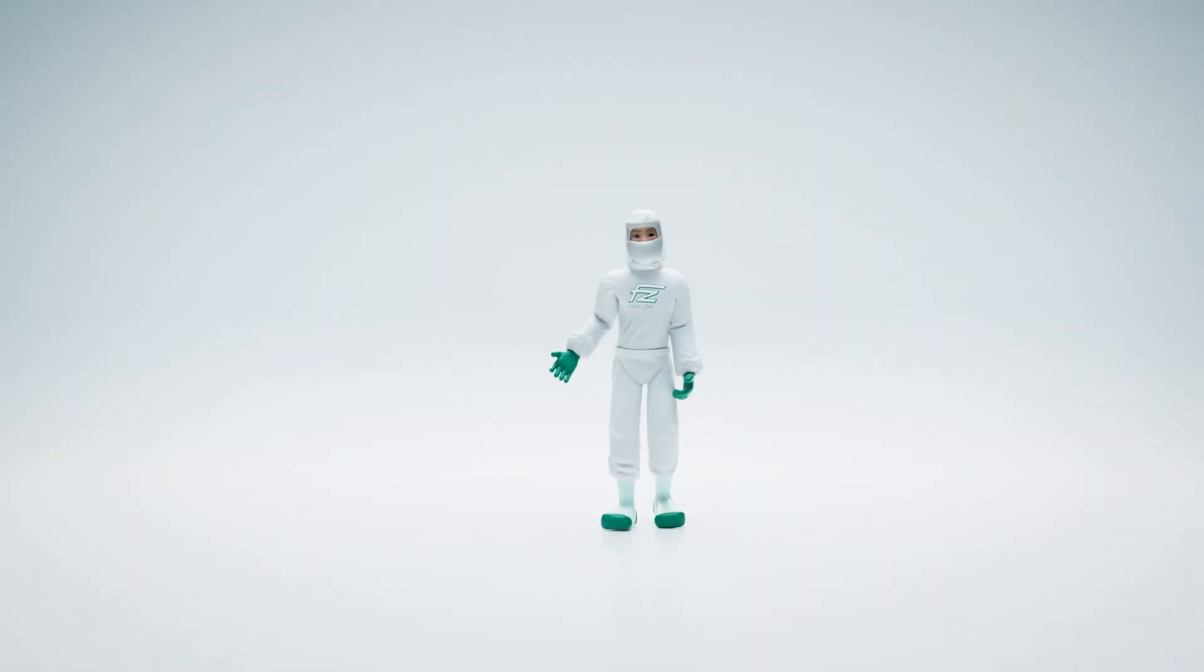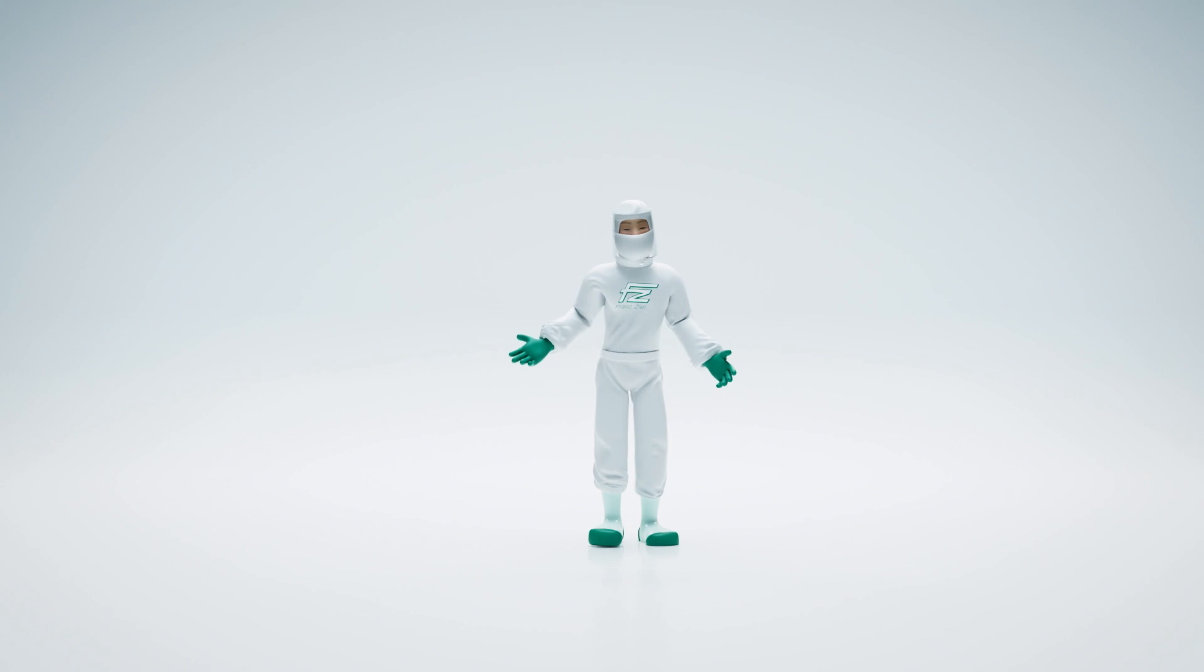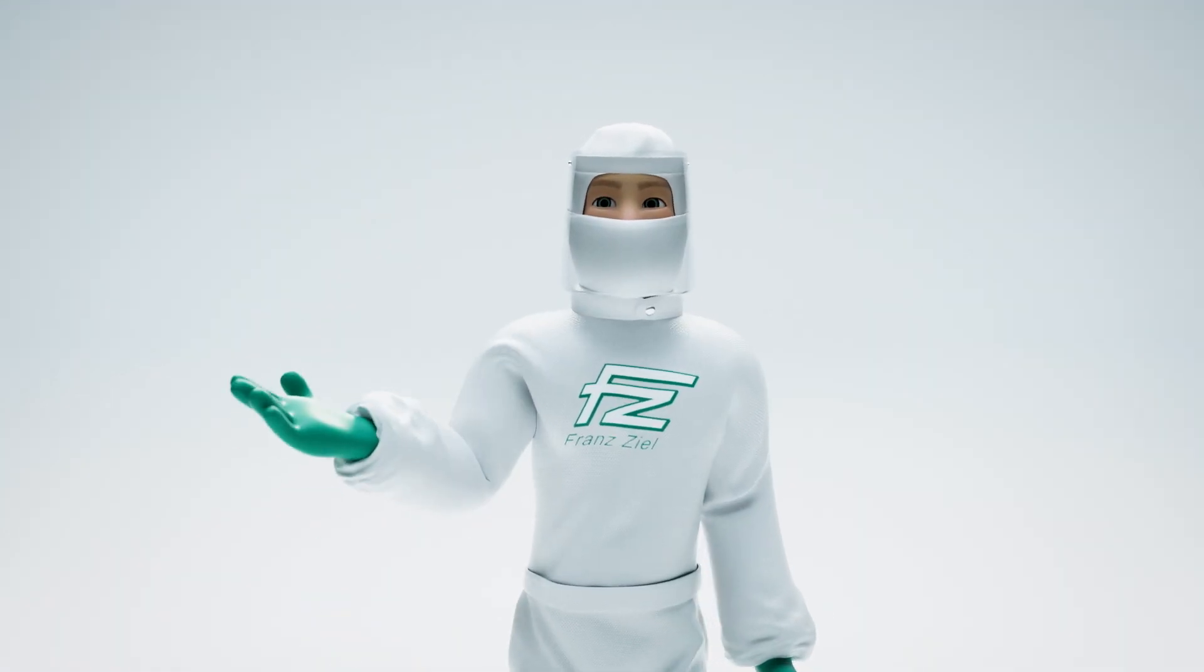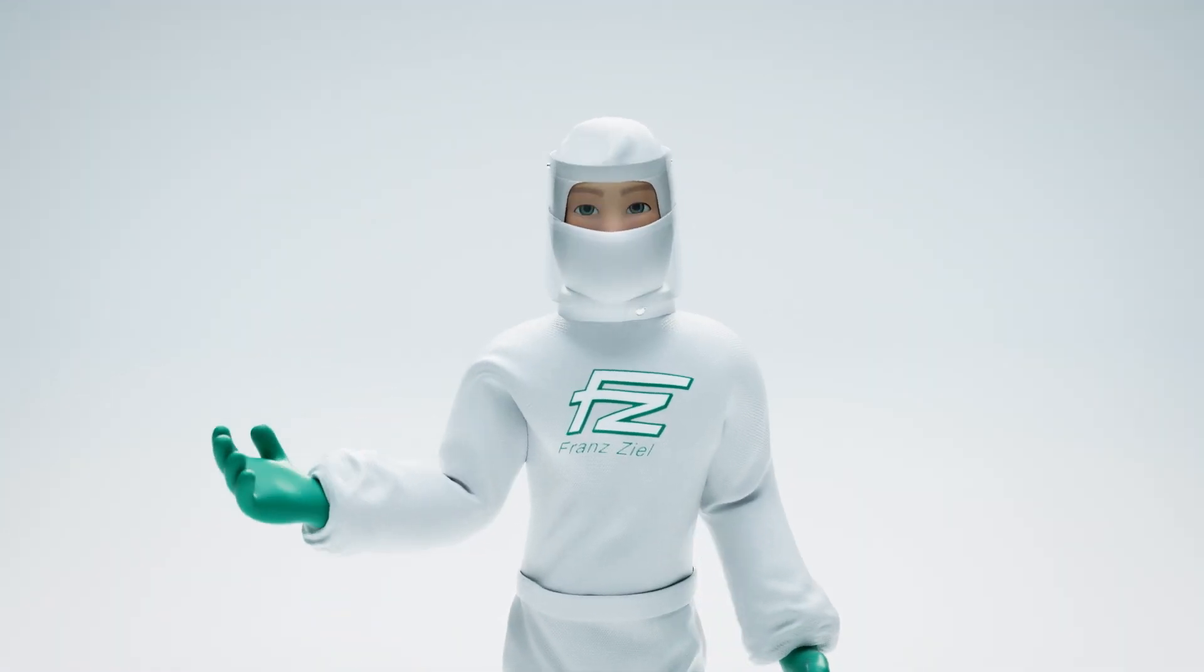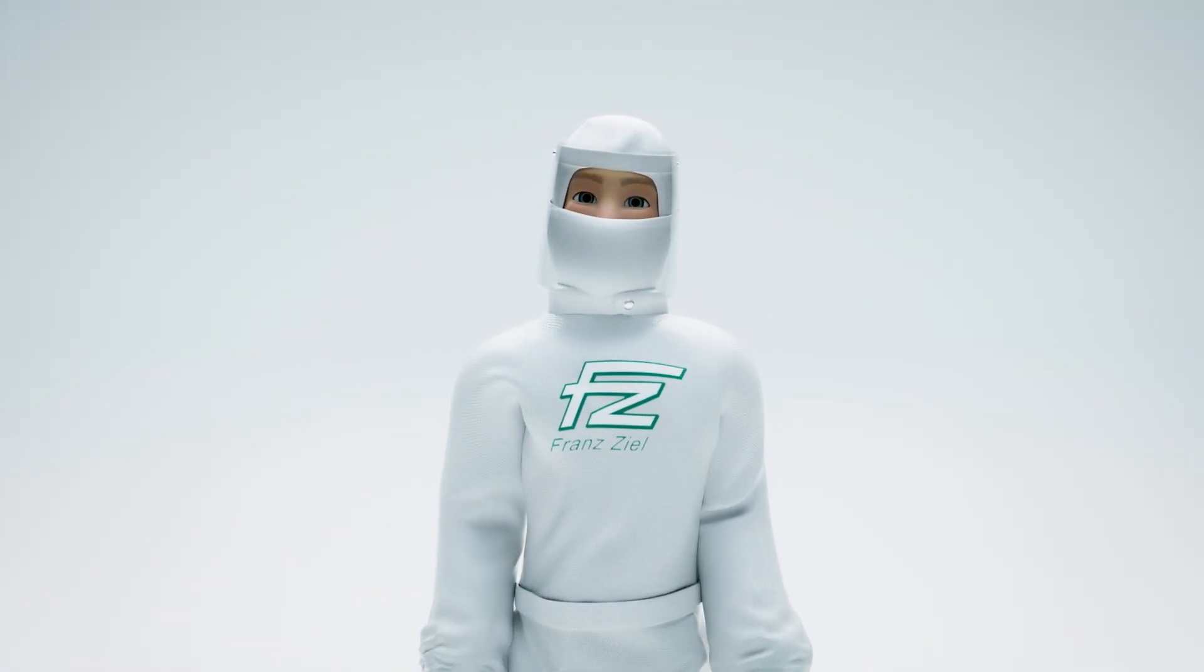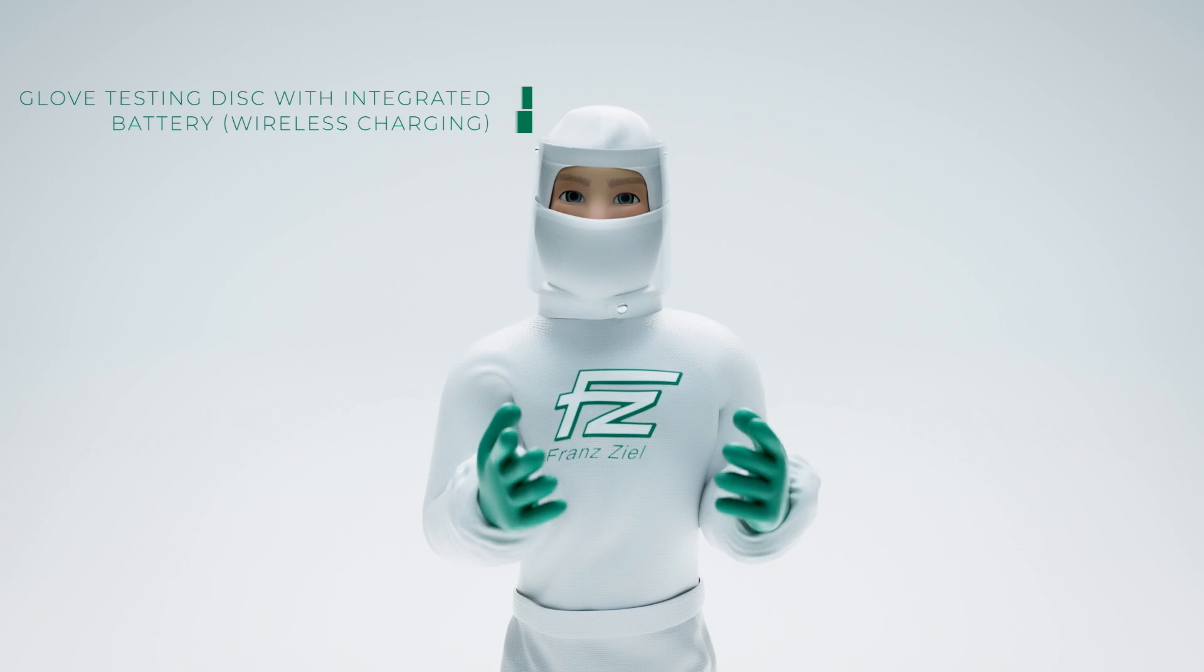Hi, my name is Zeal and today I would like to introduce you to our glove testing system. Franz Ziel provides a complete solution for the glove testing protocol.